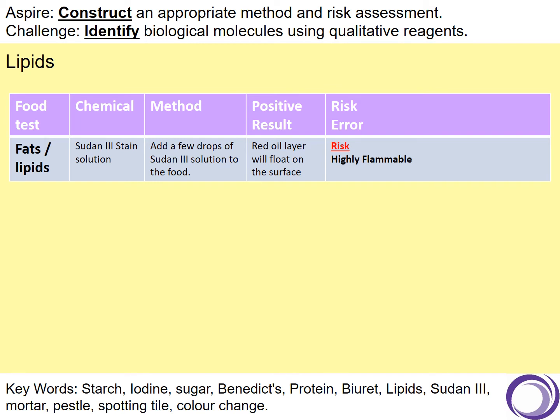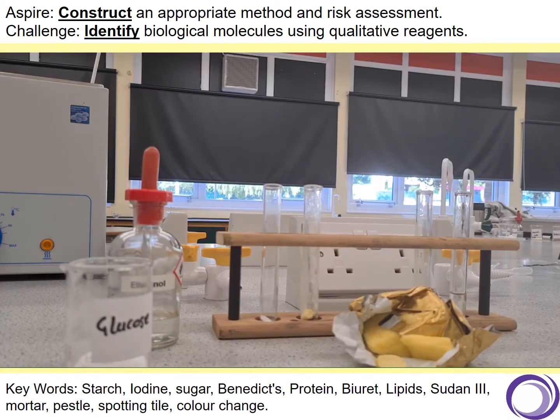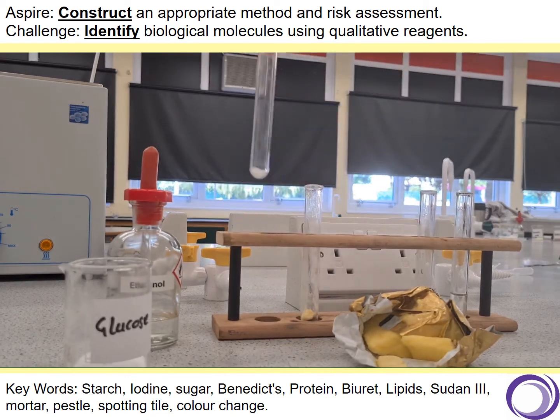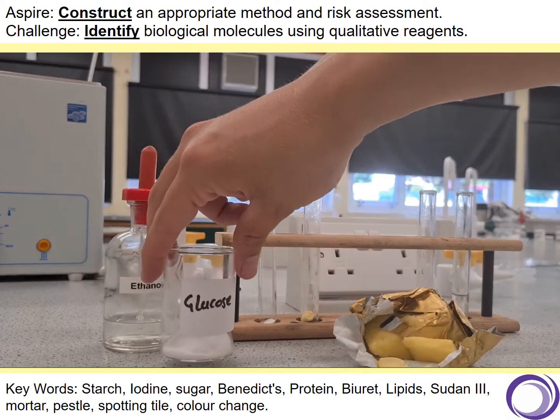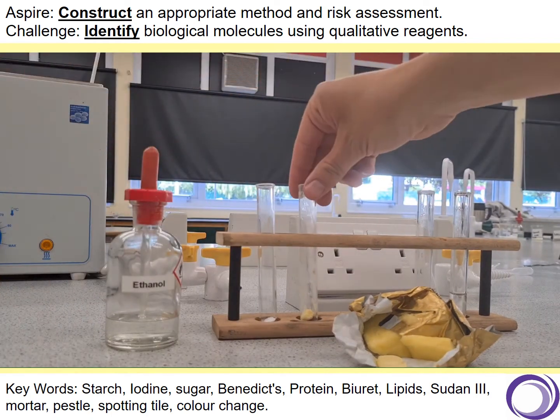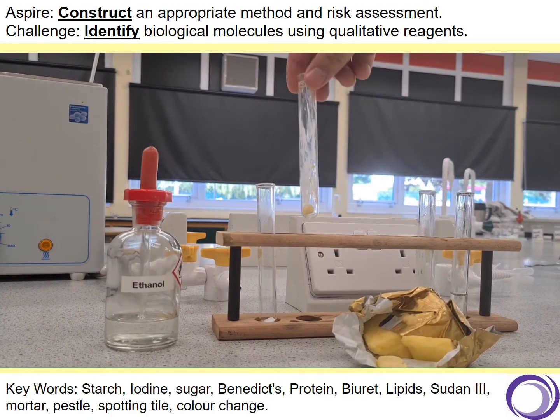That's fine for your exams, but I've shown you both tests here. This is the required practical part of the food test one. It is for lipids, also known as fats. So what I've got in this test tube here, I've got some glucose in, which has just come from here, and then in this one, I've taken some butter.